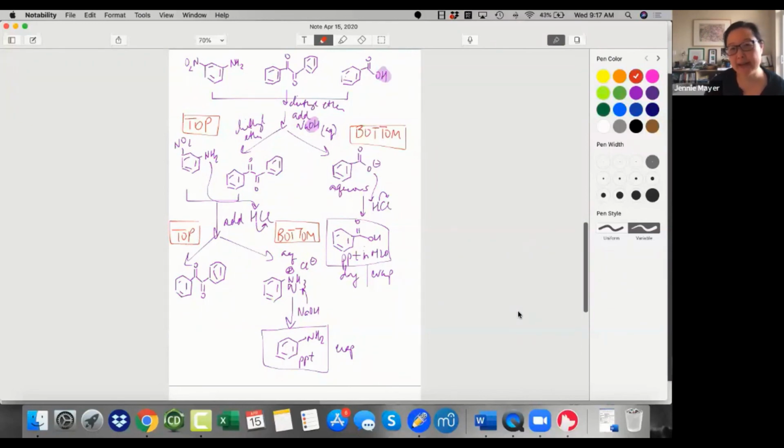But then again, if you're writing a procedure, then you want to follow some of the amounts that are in your previous experiments. Maybe think about, okay, I would take this many grams and I would add this much solvent. If you know those things, you can add them in, but some of it is trial and error too. So I understand that.